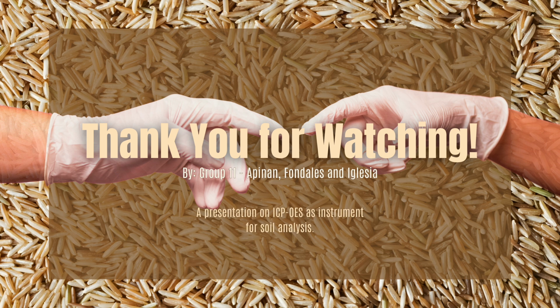To summarize, ICP-OES is a powerful multi-element technique that provides the accuracy, sensitivity, and throughput needed for reliable NPK analysis in a large horticultural soil experiment. By understanding how it works, from plasma excitation to optical emission detection, and becoming familiar with its key components, you can better appreciate why it performs so well in agricultural nutrient analysis.